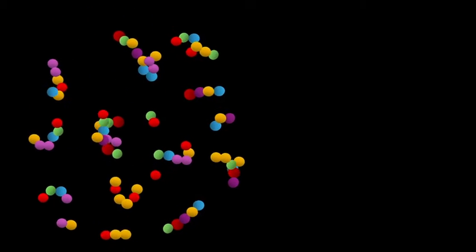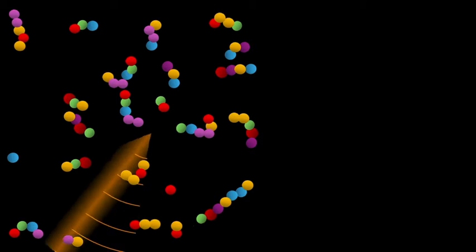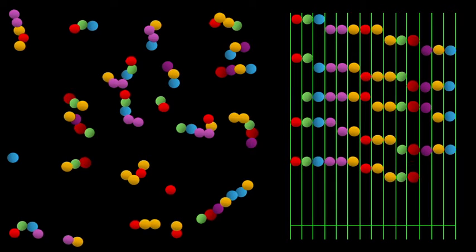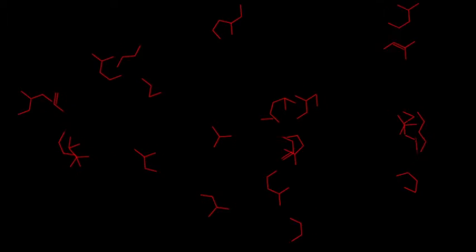Metabolomics and lipidomics studies differ from proteomics studies primarily because the molecules under study are not biopolymers, strings of repeating chemical units. There are no standard catalytic reactions performed on the sample, as proteolytic cleavage is often performed for proteomics. Further, metabolites and lipids undergo fragmentation in less predictable patterns than for peptides, so MS2 scans are used to determine identity differently. None of this materially changes how COMPAS is used to analyze metabolomic or lipidomic data sets, so most of the prior points apply equally when performing metabolomic or lipidomic analysis.